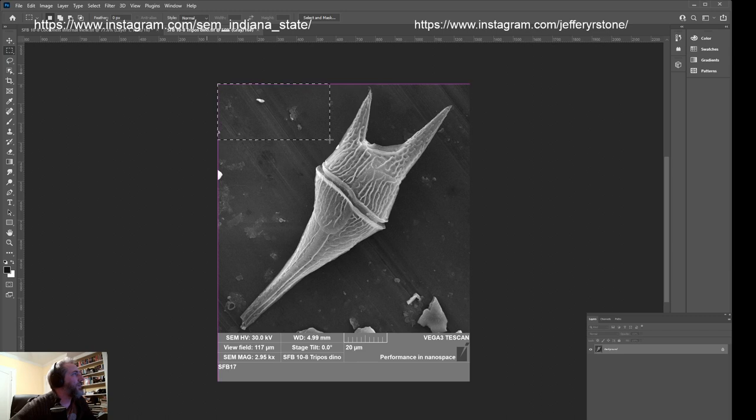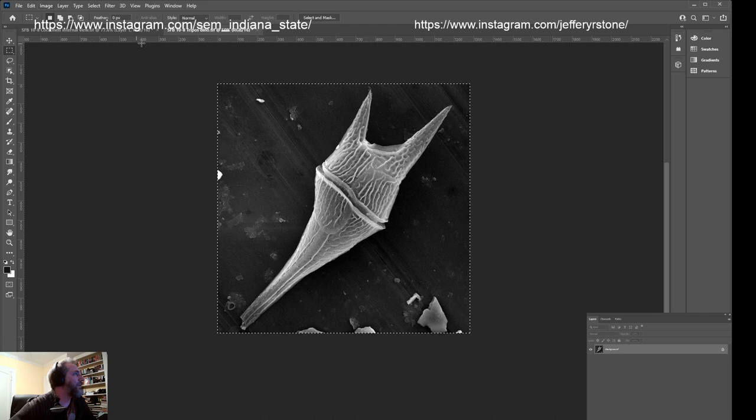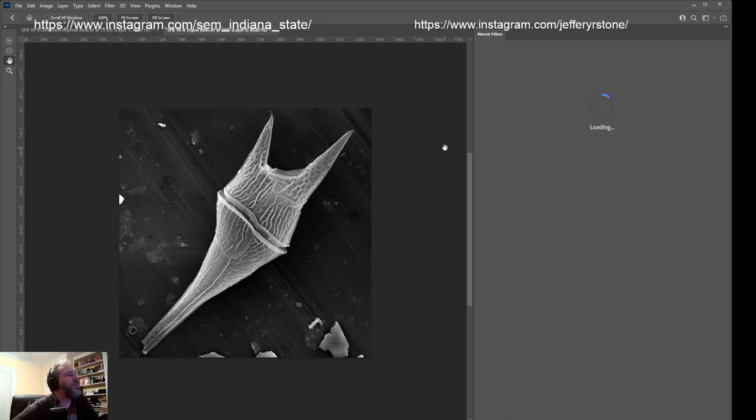Okay. So not a diatom, a dinoflagellate. This is from a recent stream, and I haven't colorized this at all yet. So I'm just going to go through the same steps I usually do. Get rid of this. I'll auto contrast. I will change my mode to red, green, blue. And then the neural filters. So it colorized automatically. I can't get it to give me the menu. Oh, hang on. Because I keep following the same step. If you go into the neural filters menu, I just wanted to show you another tool that I use.